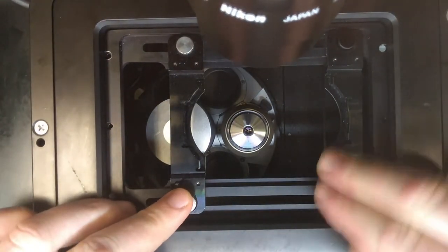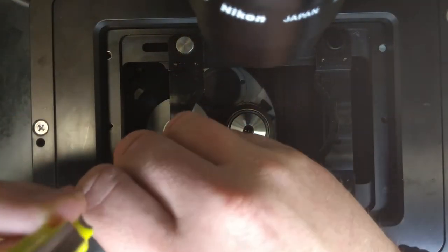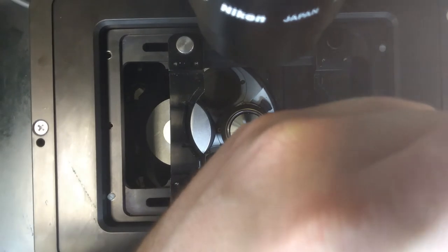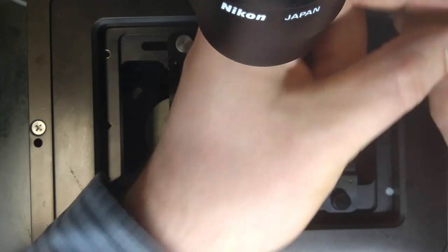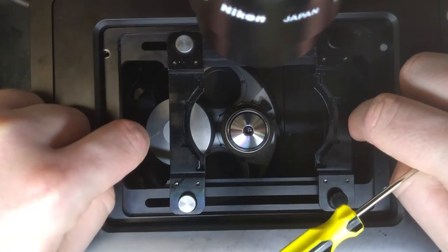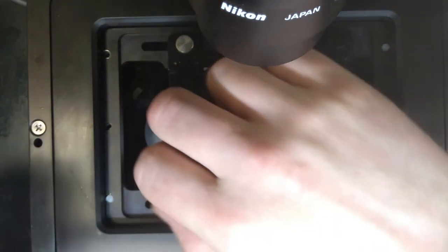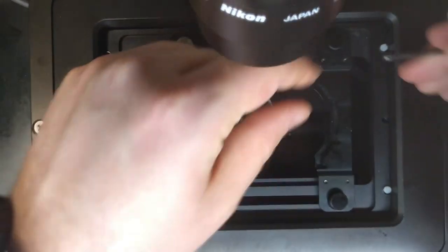You will now be able to use the adjustable stage. To remove this, simply undo the screws as before, making sure that they are completely loose. Do your best to not drop any screws down into the body of the microscope, as they are next to impossible to retrieve again.